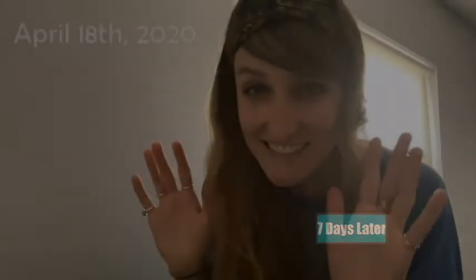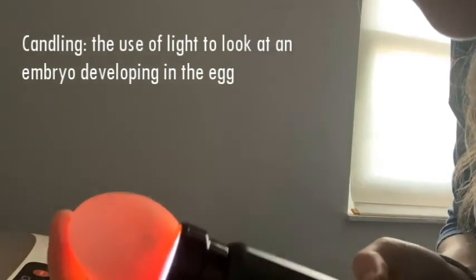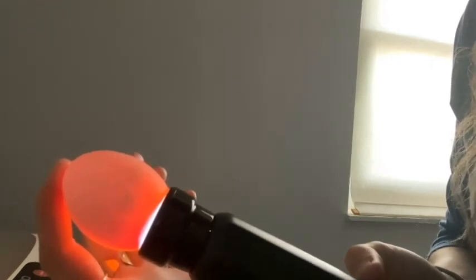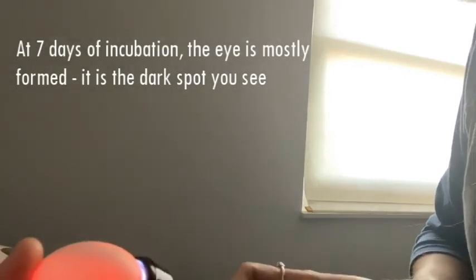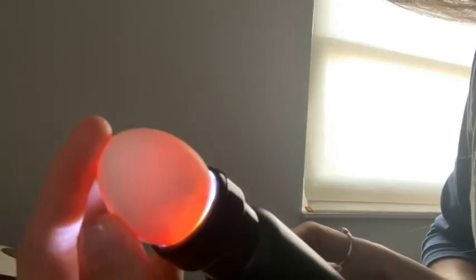It's Candling Day! So let's candle some eggs. I think Candling Day is the most magic day because you get to see an embryo inside the egg. So that little dark spot is a chicken embryo — and it's even moving. It's amazing. Look at that — right there. It's amazing.